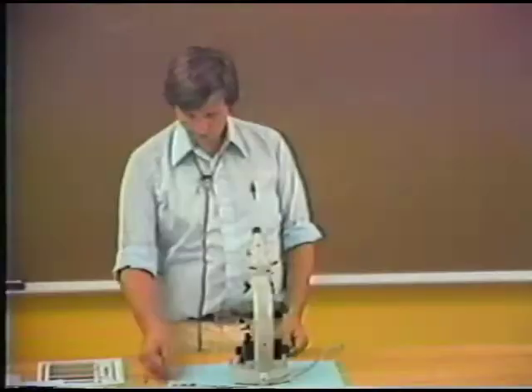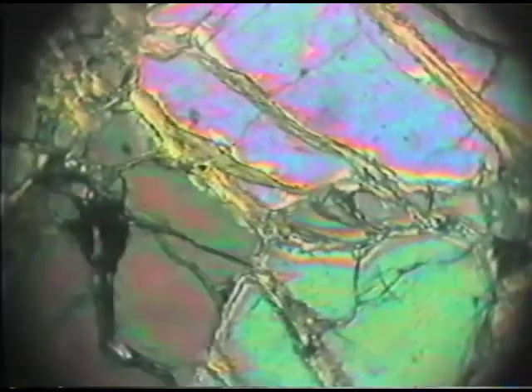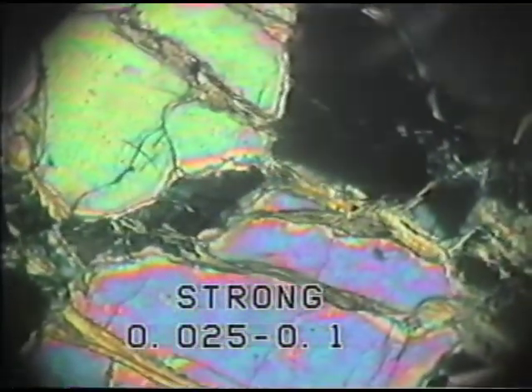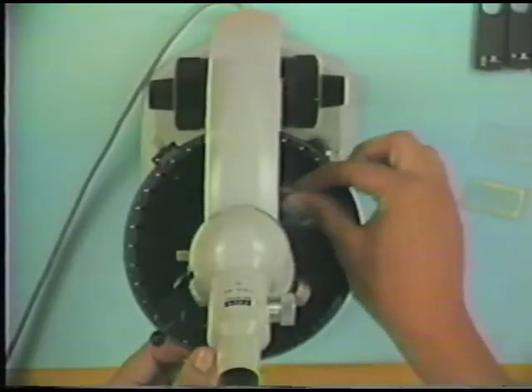Now, to illustrate higher birefringence again, we'll look at an olivine mount. The olivines show strong birefringence, equivalent to a value of 0.025 to about 0.1. These are third order interference colors as a maximum. And finally, again, calcite, and still another mount.